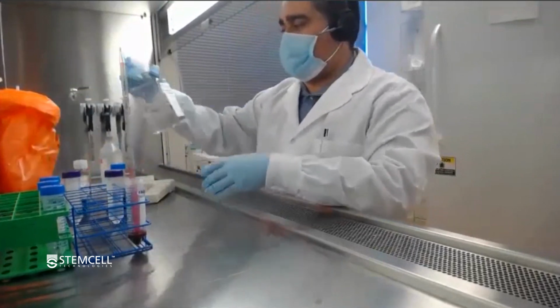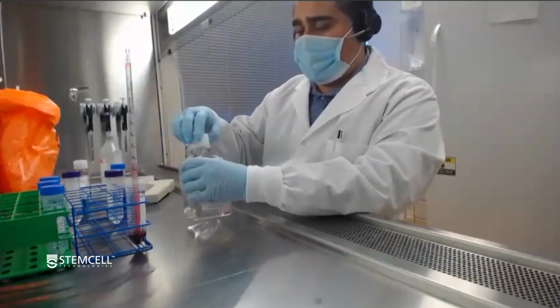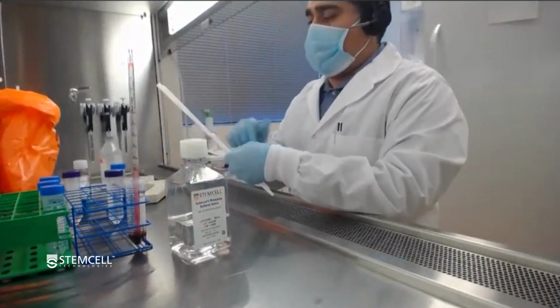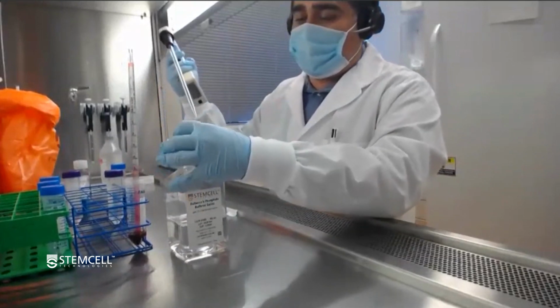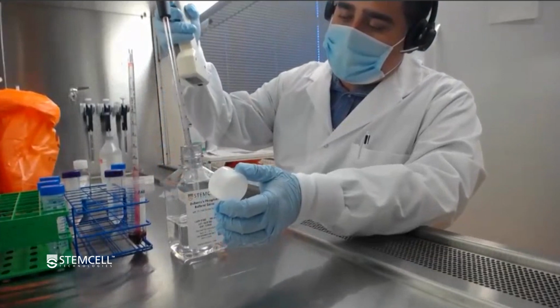And then I'm going to dilute it with PBS and 2% FBS. Here I'm just going to add an equal amount. So to my 5 mils of whole blood, I'm going to add 5 mils of PBS and 2% FBS.